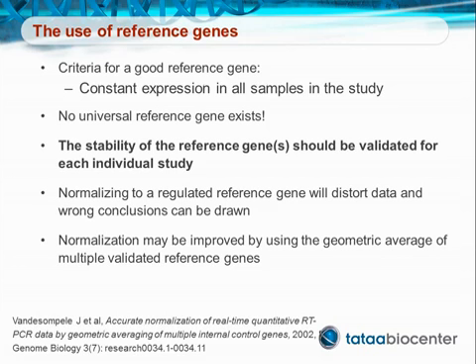However, there is no such thing as a universal reference gene. All genes are regulated under certain conditions, and using a regulated gene will actually distort your data, and you may draw the wrong conclusions from your experiments. Therefore, it is very important to verify that the gene you are using as reference gene in your particular study is not regulated under the conditions you study.